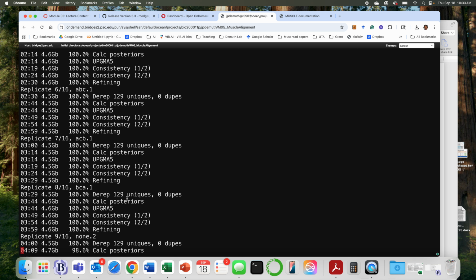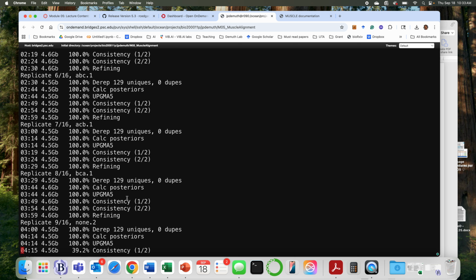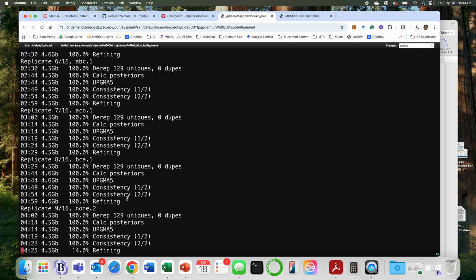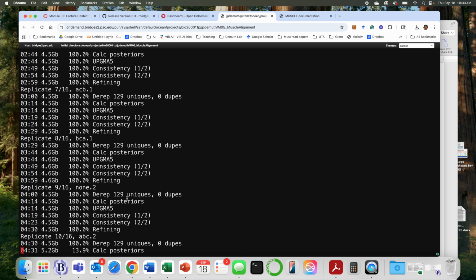Okay, and then, I accidentally started running this one again, so I ended it because I already did it, I didn't realize I was doing it again. But then when I tried to do the next step with the fast stats one, it says that they're not aligned. Is that because I ran it twice? Yeah, you don't have to.